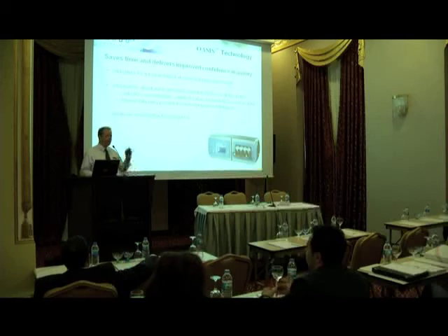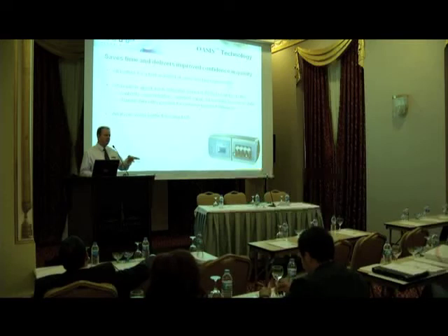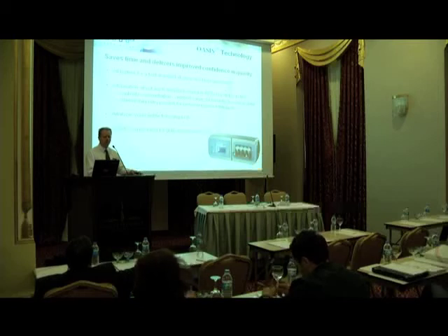If a standards bottle is used by the analyzer, as soon as it's finished with that standards bottle, it voids the RFID tag. So if somebody was to mistakenly use that bottle again in another analyzer, it would reject it. So there's a high level of confidence built into this analyzer to make sure we're doing the right thing.